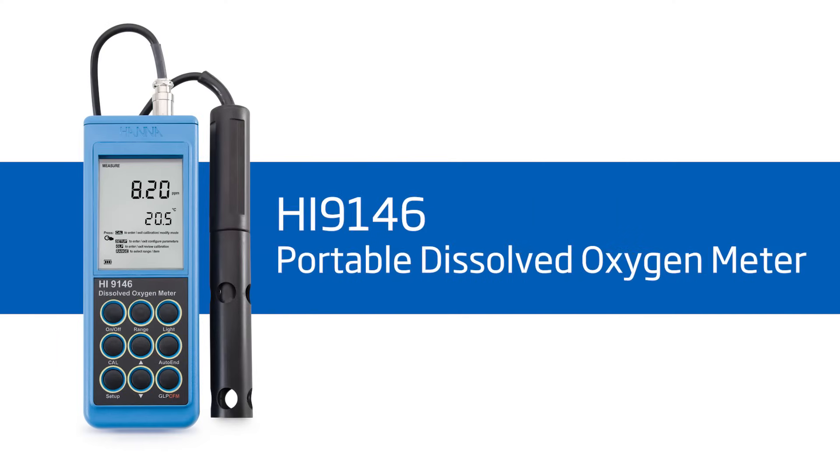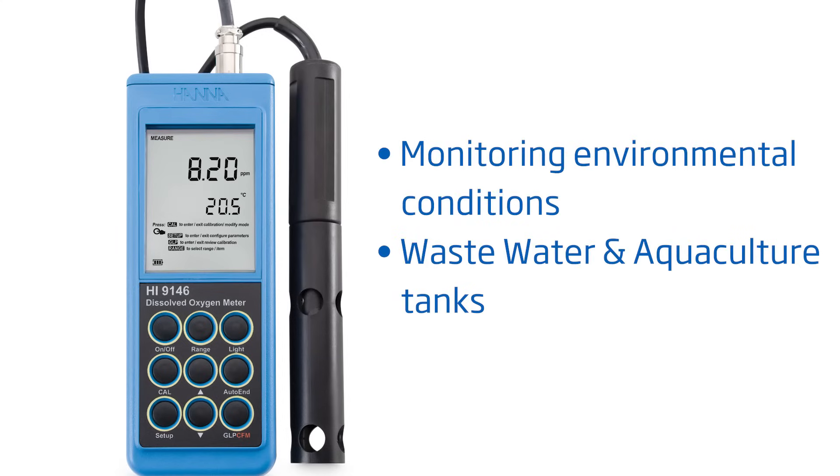Hi everyone, I'm Tiffany with Hanna Instruments, and today we will be going over the Hanna HI-9146 Portable Dissolved Oxygen Meter. Your meter comes with everything you need to begin testing DO. It's perfect for field use and monitoring environmental conditions, wastewater, or aquaculture tanks. Hanna Instruments provides you with affordable, quality equipment to help you achieve professional results.